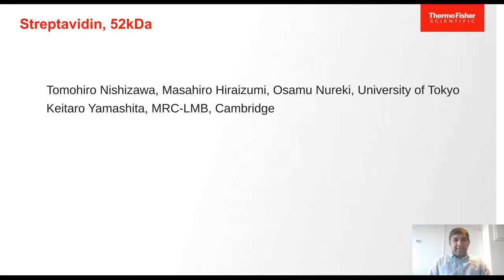This collaboration was initiated by Tomohiro and Masahiro at University of Tokyo. They were working there on streptavidin. Streptavidin is a very small 52 kilodalton protein. It's very flexible and very heterogeneous.